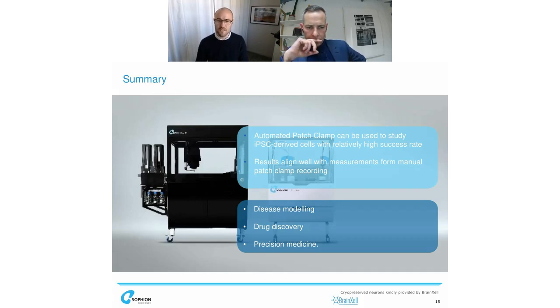So we also have done some experiments on the QPatch, and here you typically see that this is not an issue. So we typically recommend, if you're looking at mechanistic studies, the QPatch might be the better choice. We found that with the Cube, many people still use it for voltage-gated sodium channels, since you can do this time matching. So it might not be so much of an issue if you're testing a compound, but you're testing all the compounds at the same time in the experiment. So you know that any sort of shift in the gating kinetics that may have occurred would be time matched, which then allows you to rank your compounds equally. But this might be the reason for this change.